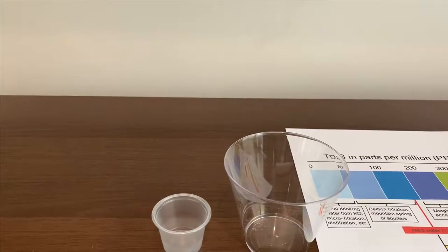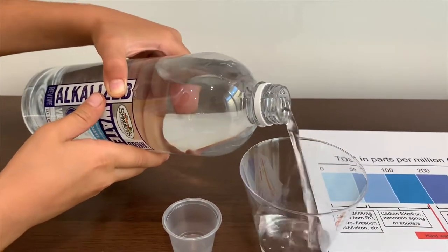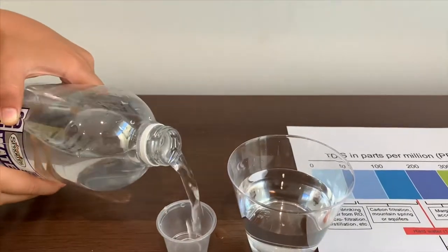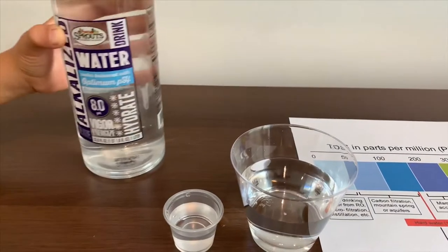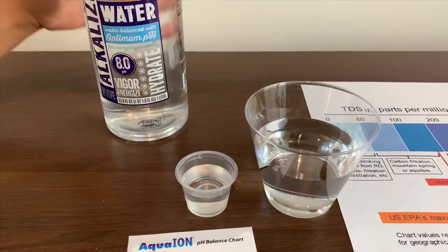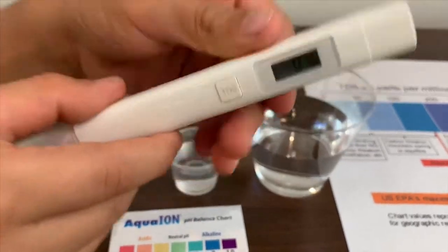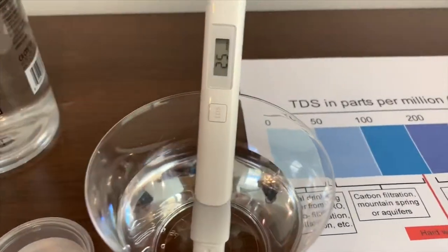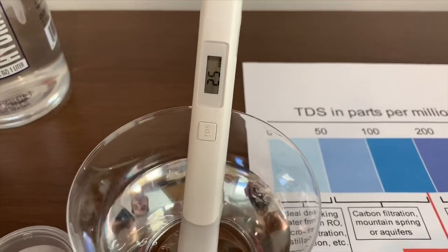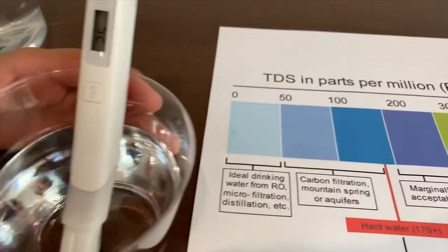Let's pour some in to do the TDS and pH test. When you turn it on, make sure it says 0, then put it in carefully. It says 25, that means it is ideal drinking water.